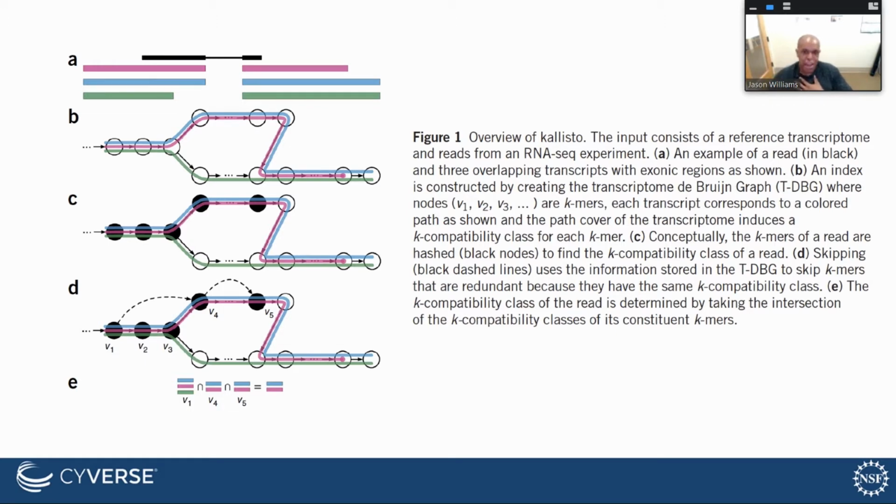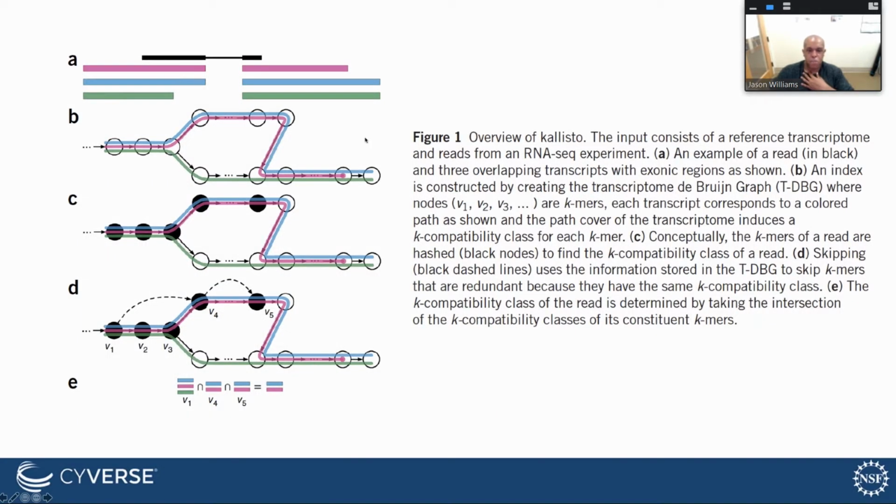The analogy, and also, let me just say before I say my analogy, it also turns out that you can tell quite early on, sometimes from the first one or two k-mers, that you can discard most of the transcripts as not possibly having generated this read. So it's the very beginning and very end of this matching process where you can tell what you're looking for.